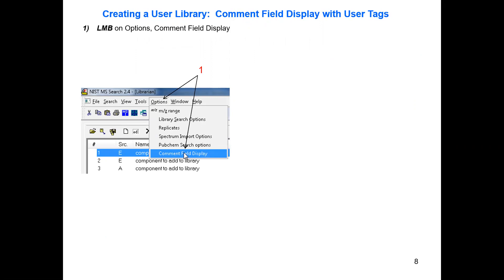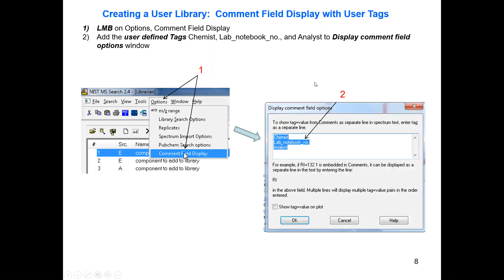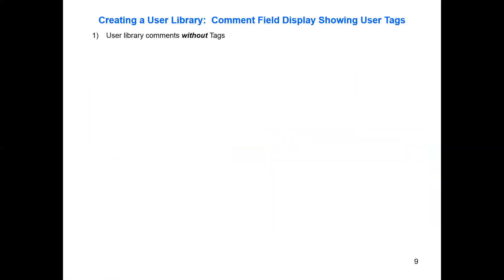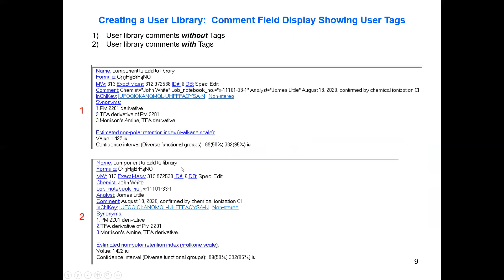When you do this, you have to create a comment field display and tell the software that you've created this comment tag. You go into the Options pull-down menu and add these tags — I added chemist, lab notebook number, and analyst — then say OK. What it normally looks like without tags: you have your component in the library, your synonyms, but all the comments show up together. After you create those tags, now when it comes up it'll look easier to read — you'll have chemist broken out as a separate line, the laboratory notebook number, the analyst, and anything left over in the general comment field. It also creates the InChIKey automatically when you do these things, which is nice for exact structure searching.